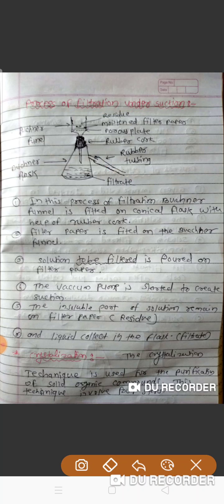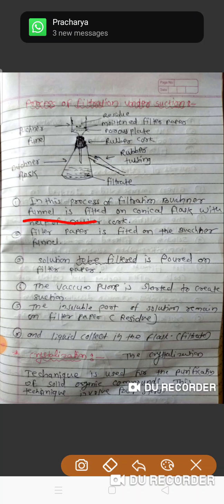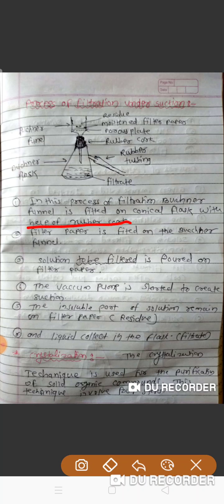In this process of filtration, the Buckner funnel is fitted on the Buckner conical flask with the rubber cork or rubber bung. First, we fit the Buckner funnel on the conical flask with the help of the rubber bung. Here, this is the rubber bung, which is seen in black color. Then the filter paper is fitted in the Buckner funnel.